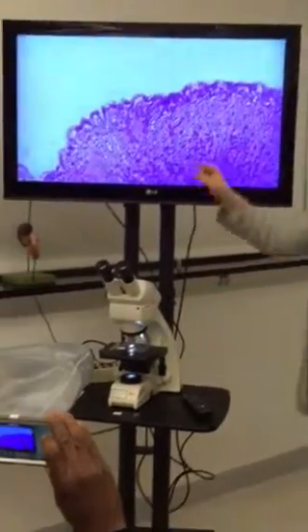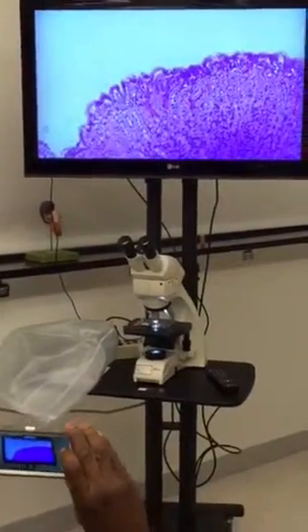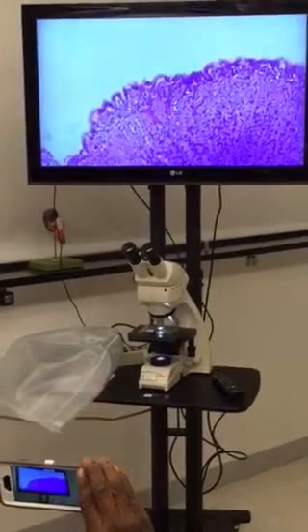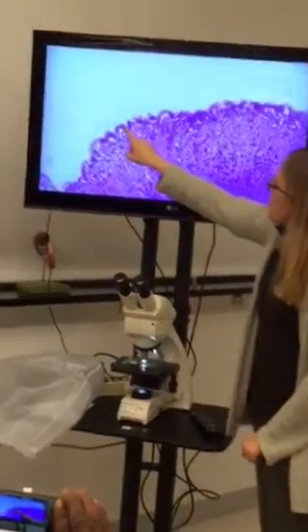Okay. Notice though there are not big waves. That's part of the small intestine. Those are the villi. Okay, so in the stomach, mostly it's churning. You're not really absorbing much at all. Okay, and so there, you only have the villi where you're absorbing a lot of nutrients, like in the small intestine. So simple columnar cells will be towards the surface.